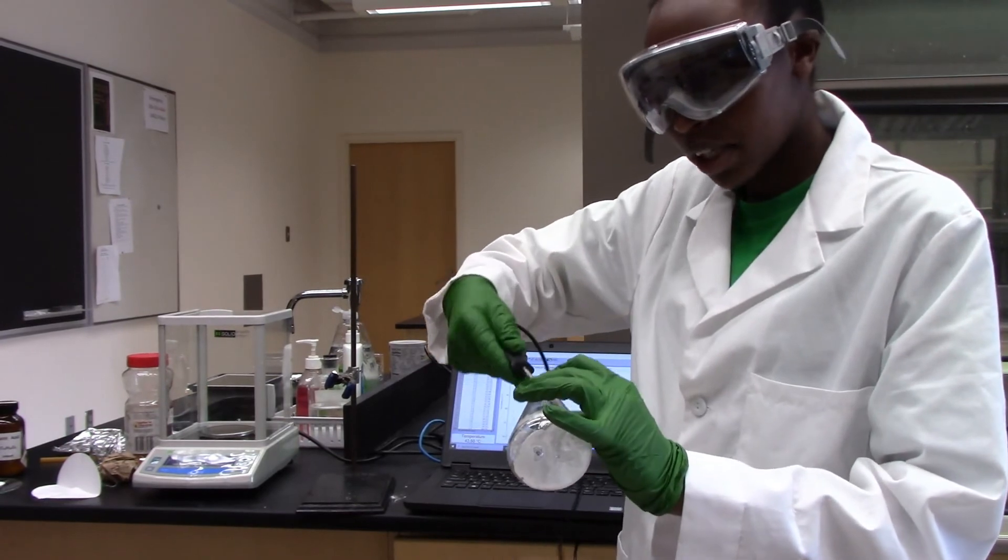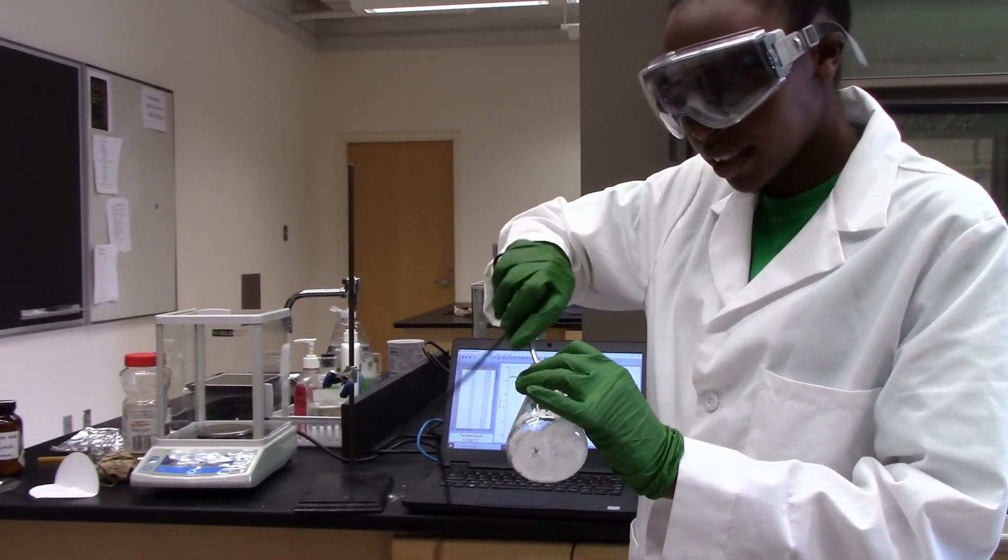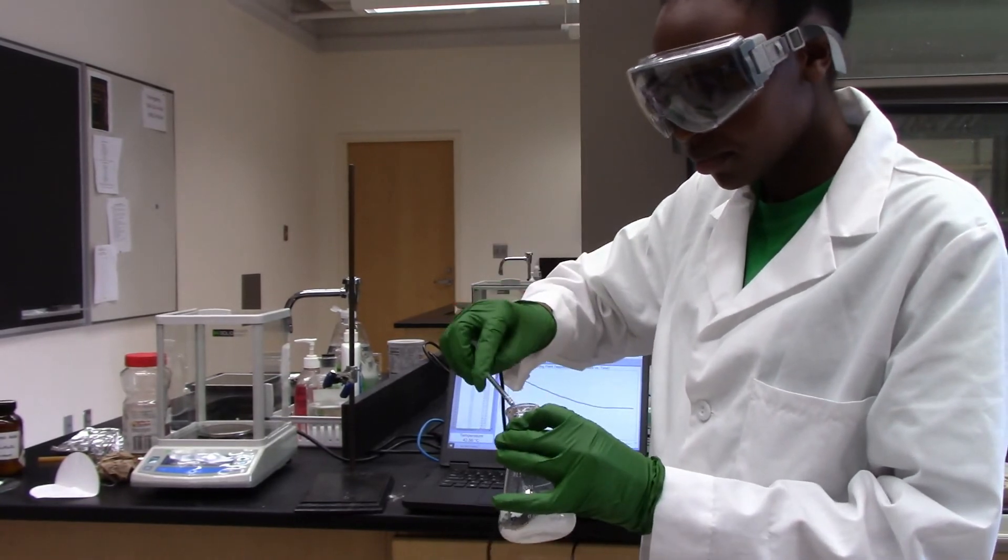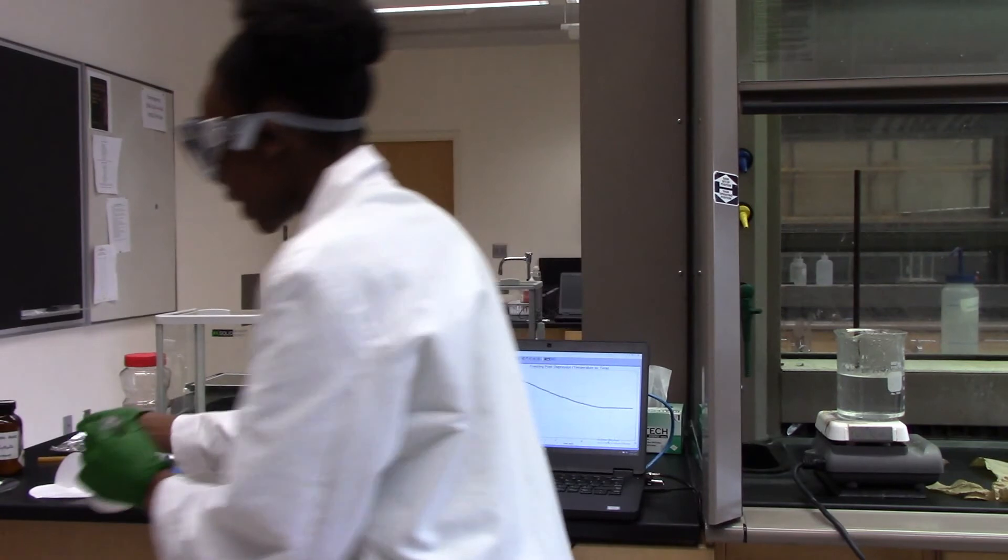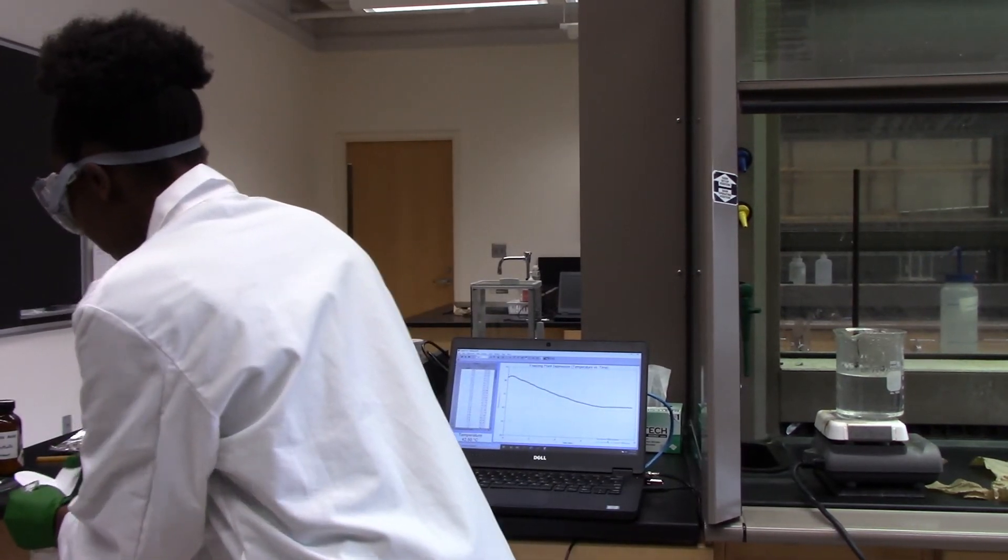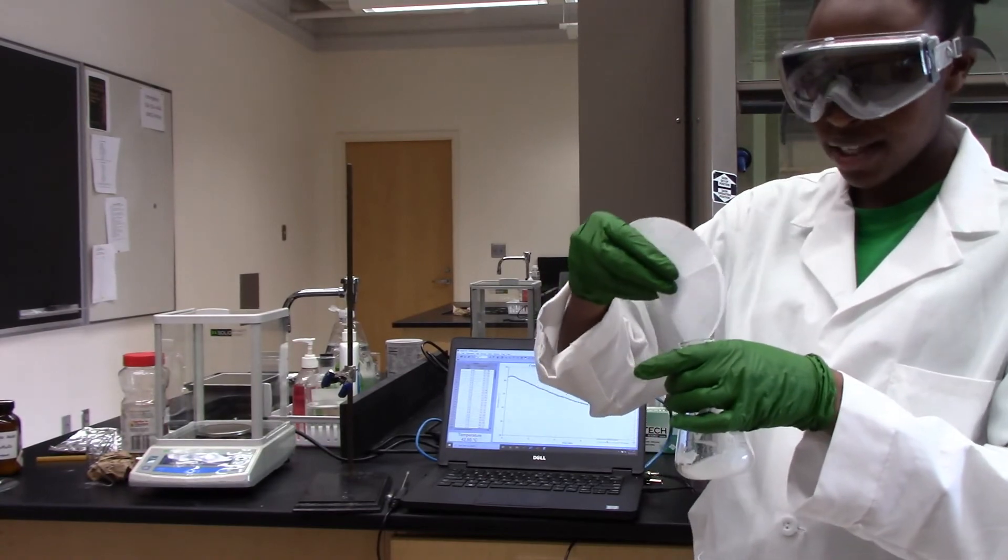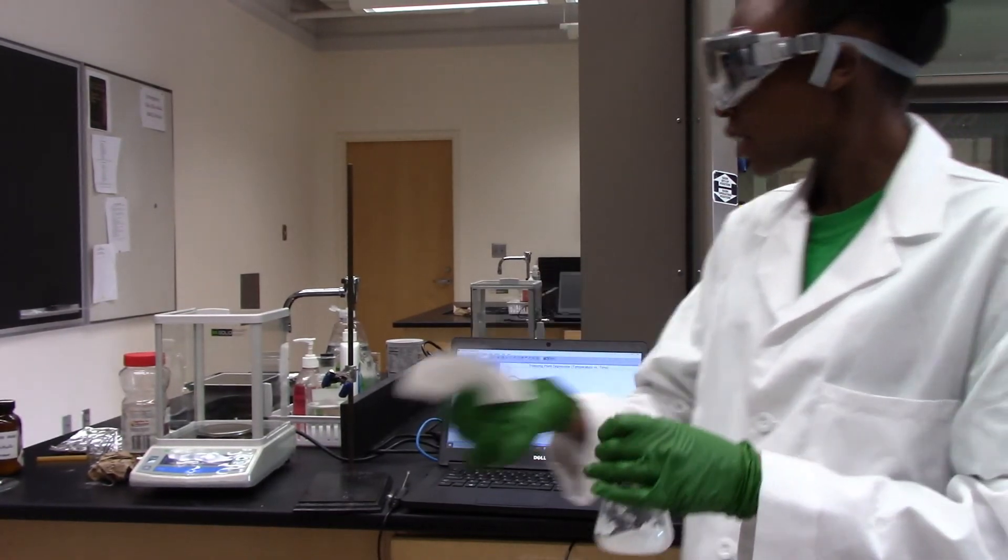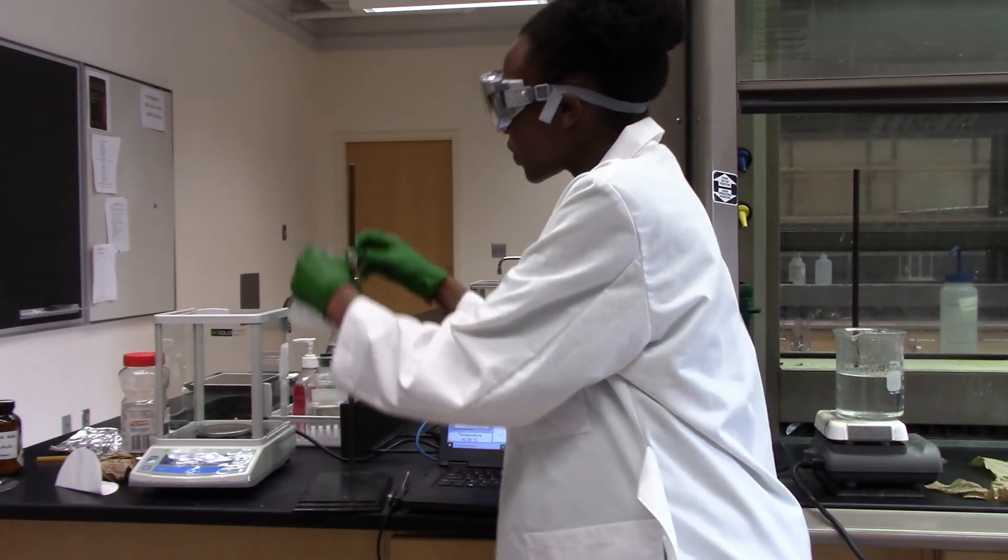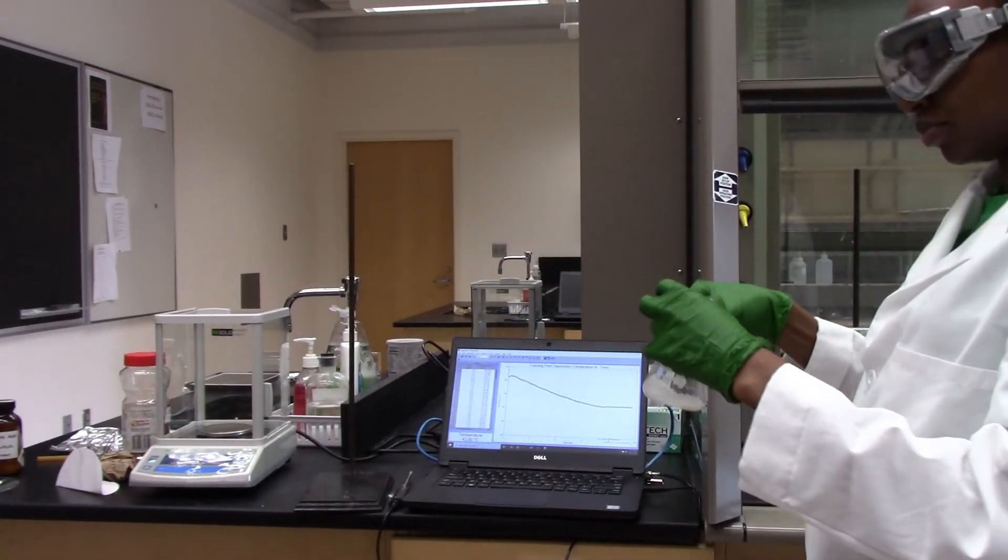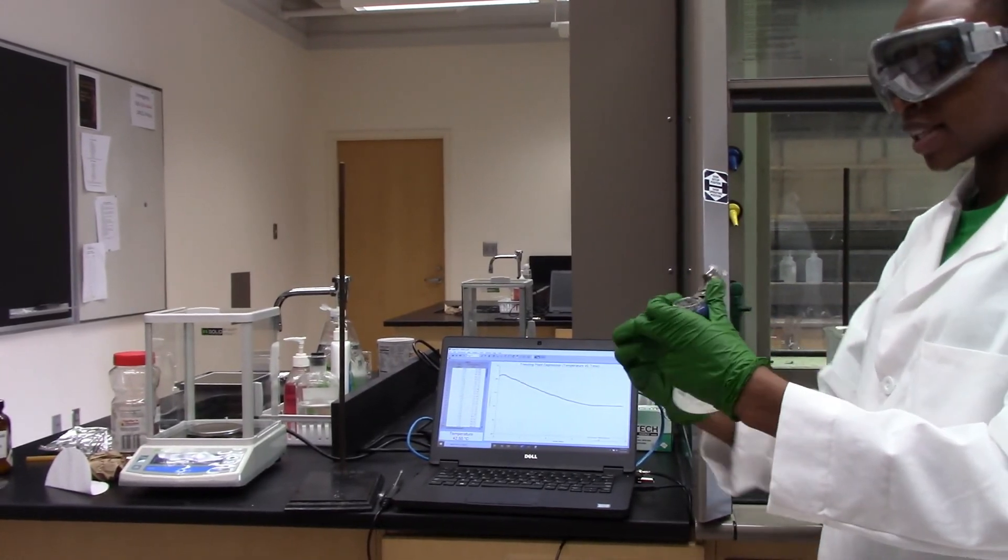Okay, first I'll make sure that my temperature probe doesn't have any lauric acid on it. And I will take my unknown number one, and I'll just put it in the flask, and again, I'll put this in my water bath and warm it up until it's a liquid.